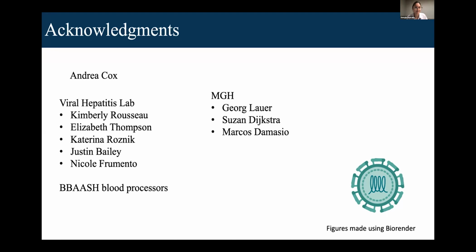Yeah, that makes sense. So the way we would normally approach the challenge would be to stain the cells with the unlabeled pentamer, and then come in with the fluoro tag, which binds onto the end of the epitope tag that's already pre-labeled with APC or PE. Yes. So then you would just add that into all your other flow panel. Was the problem that it couldn't be used in conjunction with your multicolor flow panel?